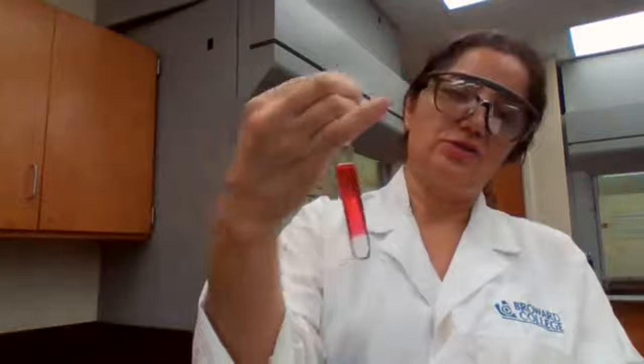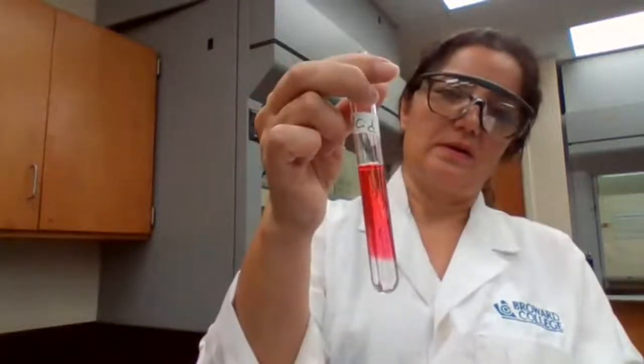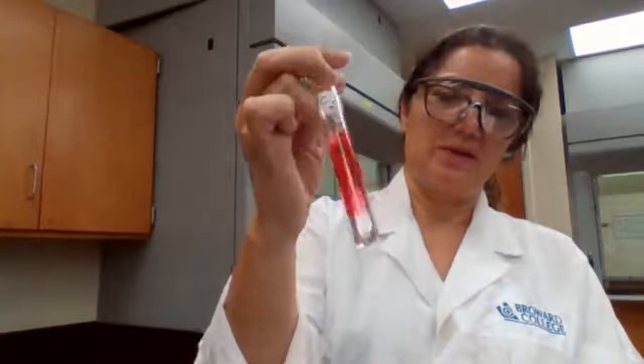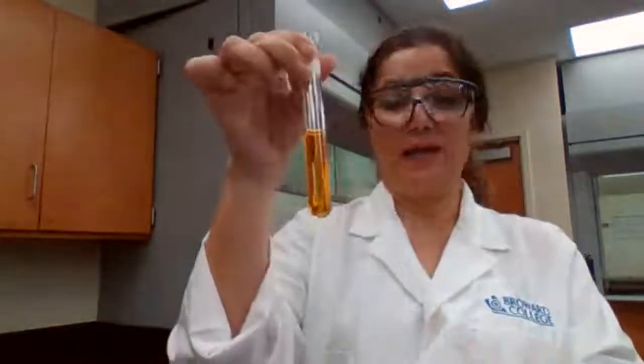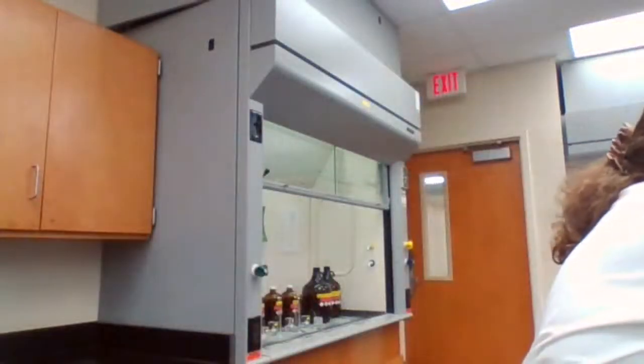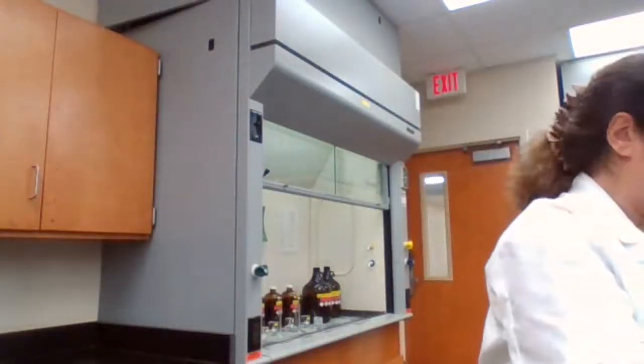It should go to the color of the HIn, which is the red color, and in basic solution it would go to the In-. So you have to defend it based on the color of the indicator in acidic and basic solution.